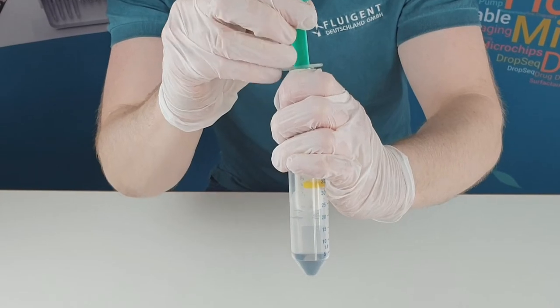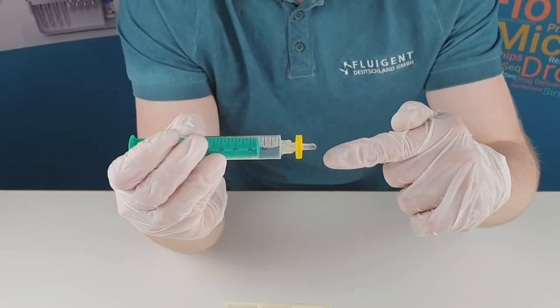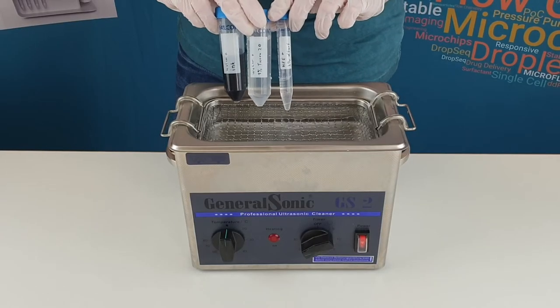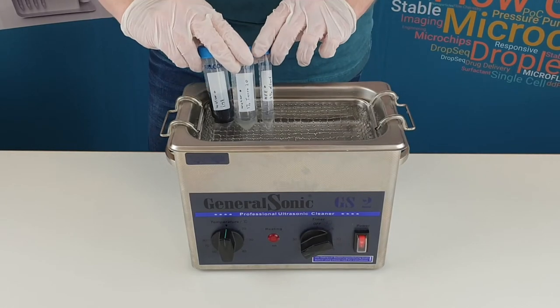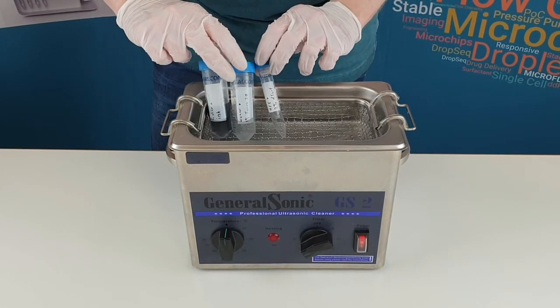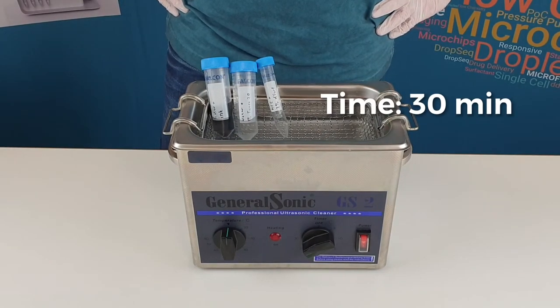It is crucial to filter the liquids in order to avoid clogging. We use a bore size of 0.2 micrometers. It is also important to degas solutions to minimize the appearance of air bubbles inside the system. For that, we degas reservoirs of all three phases in an ultrasonic bath for 30 minutes.